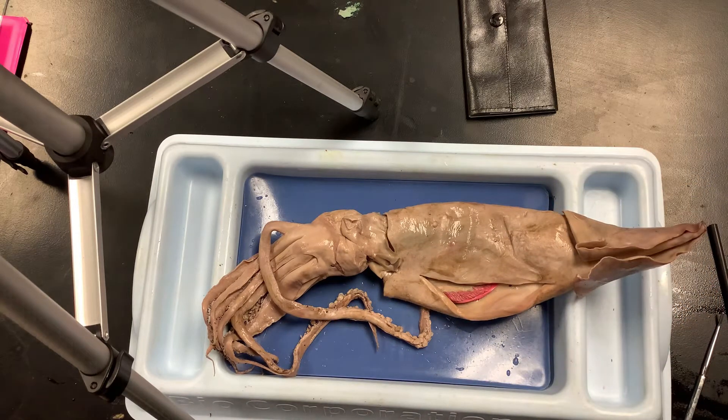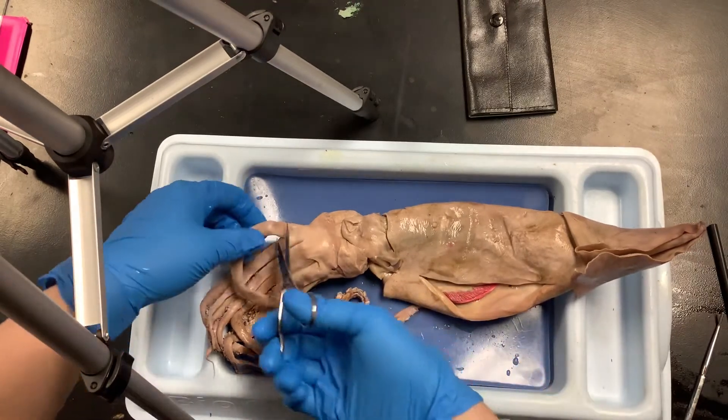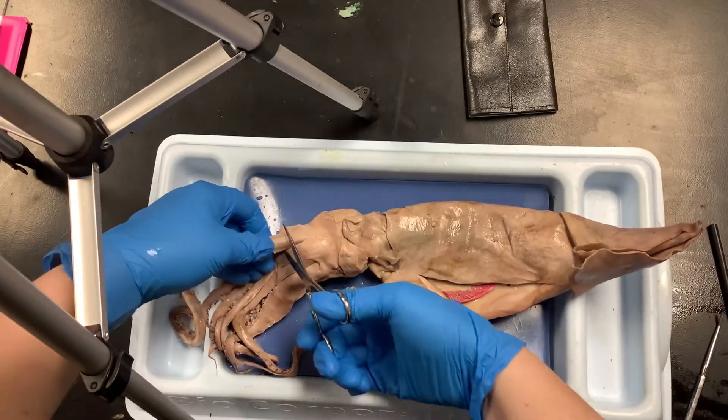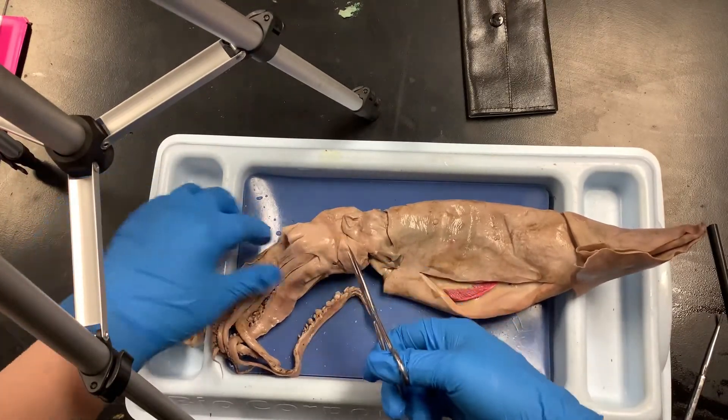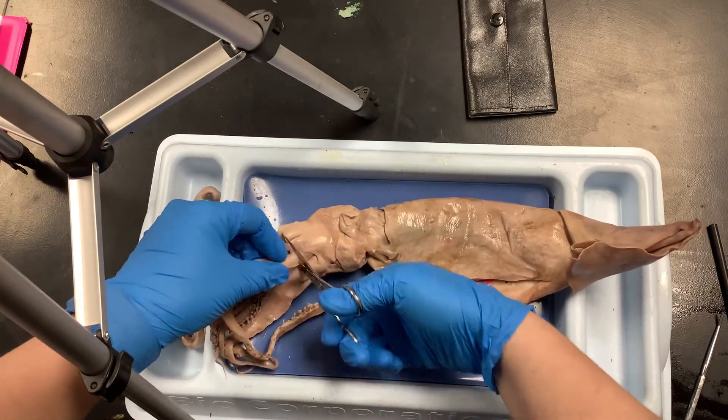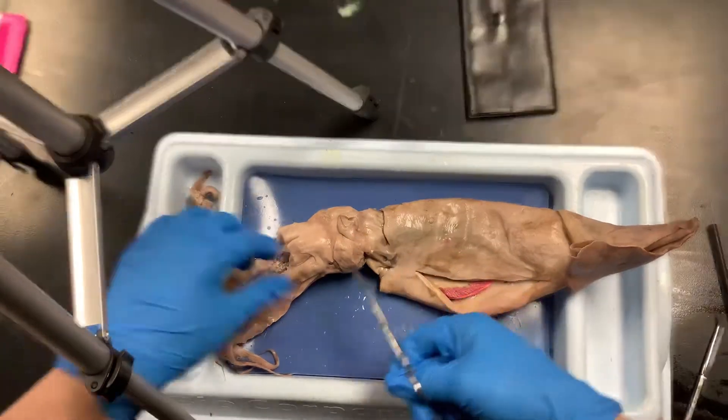Grab your scissors — we're going to cut the tentacles and the clubs off just to make this a little bit easier. Cut as close up to the top as you can. We're just going to remove the tentacles and the clubs so that the squid is a little bit easier to work with.